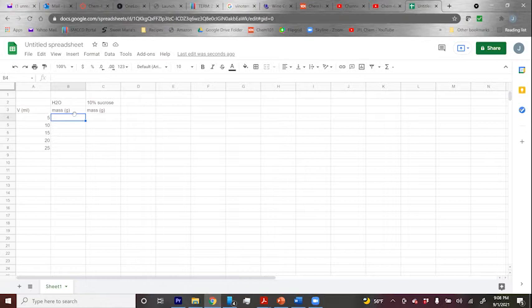Oh, I need to subtract. My calculator. I forgot to subtract the mass of the cylinder. Oops.